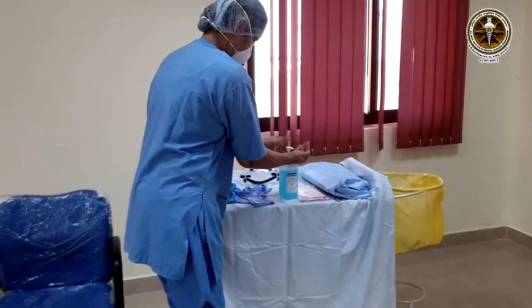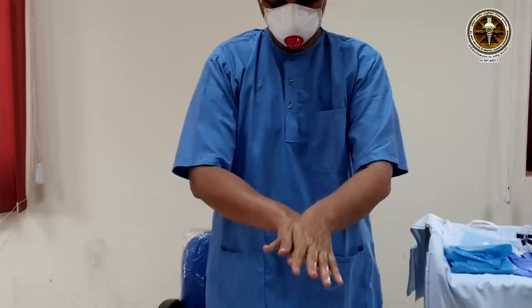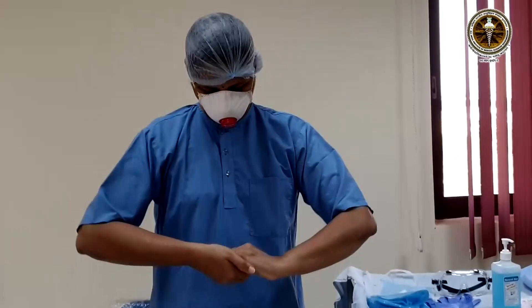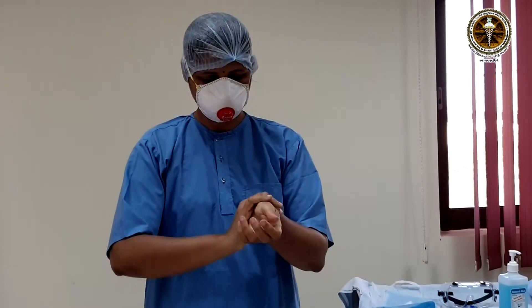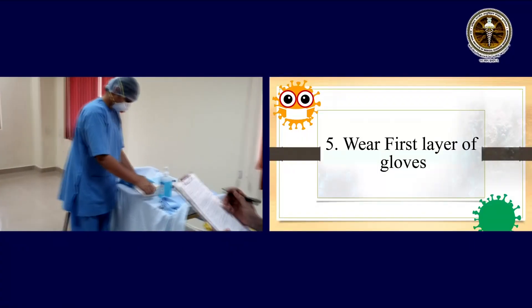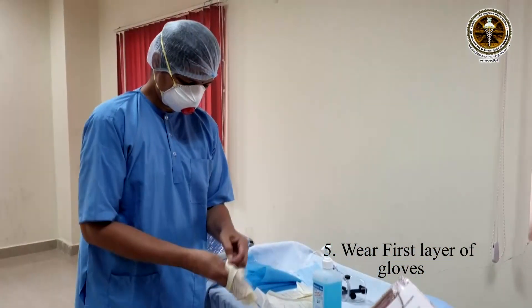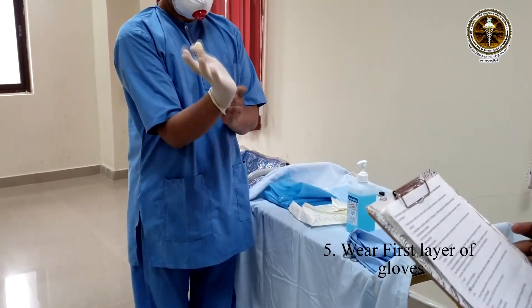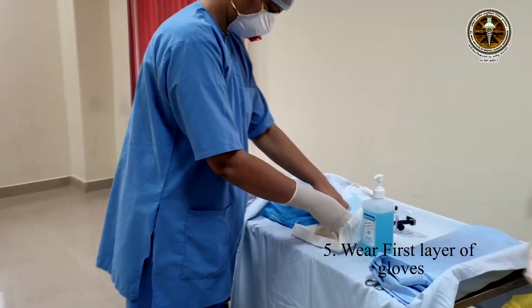Now perform hand hygiene and dry your hands. Wear the first layer of gloves. The first layer of gloves should be snugly fitting. After wearing the gloves, inspect for any damages.